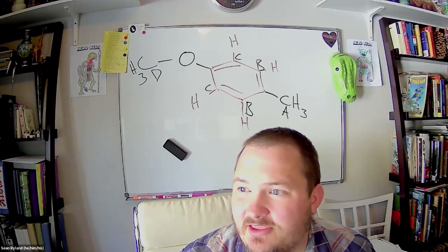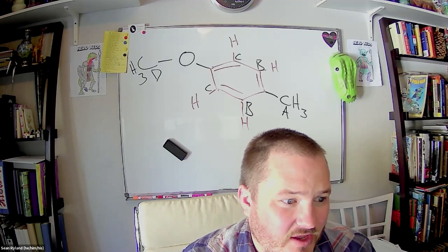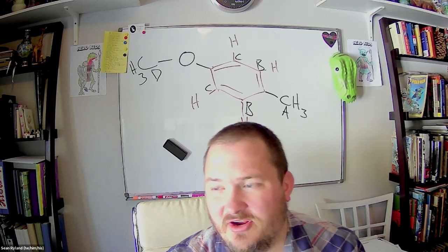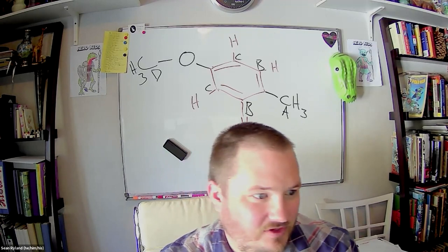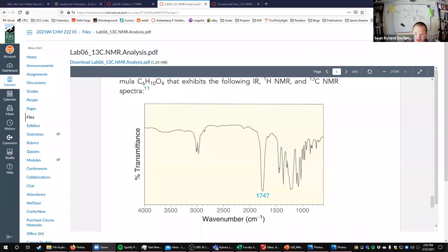So we know that anything with carbons and hydrogens, you're going to see peaks right around there. So we should be looking for it. And don't be afraid, if you're not printing it out, you might actually want to get out a piece of paper anyway and hold it up to give yourself a ruler to see exactly what you're looking for. Or if you have a tool that'll let you draw a straight vertical line, you can do that.